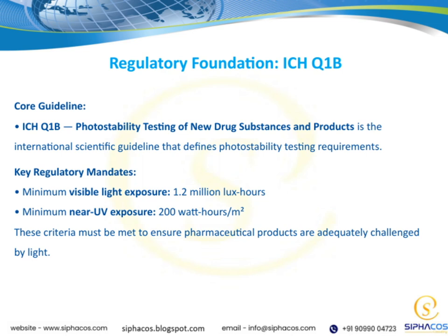Meeting these criteria is crucial because it guarantees that pharmaceutical products are adequately challenged by light, helping us predict how they will behave in real-world conditions. This way, we can safeguard the quality and efficacy of the medicines we develop and distribute.